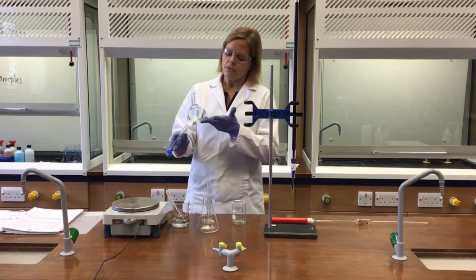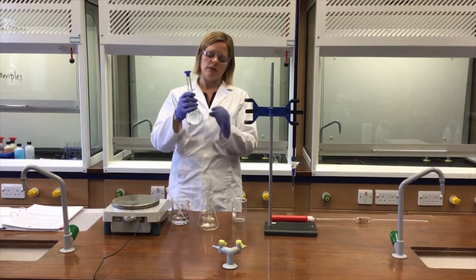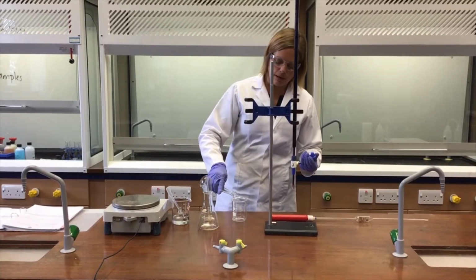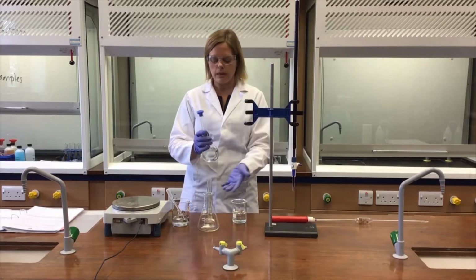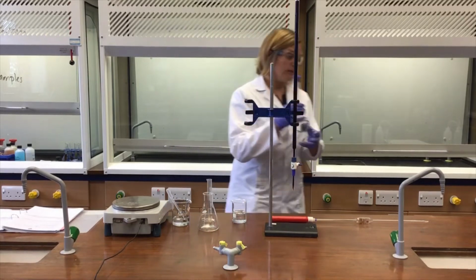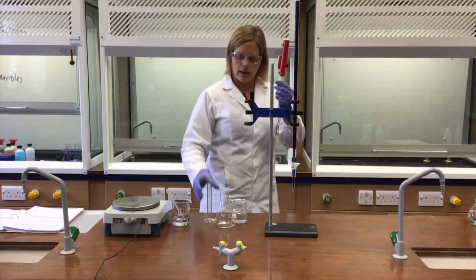So to start off with, I've made sure I've got that solution that we made up last time, and I've made sure it's been inverted several times so that it's the same concentration all of the way through. I'm going to pour a little bit of that into a beaker because it's much easier to pipette from a beaker, but also if I have a disaster and knock the beaker over and spill it, I've still got some solution, whereas if that happens with the flask, then you might have to just start all over again, which is not great. So I'm taking a pipette.